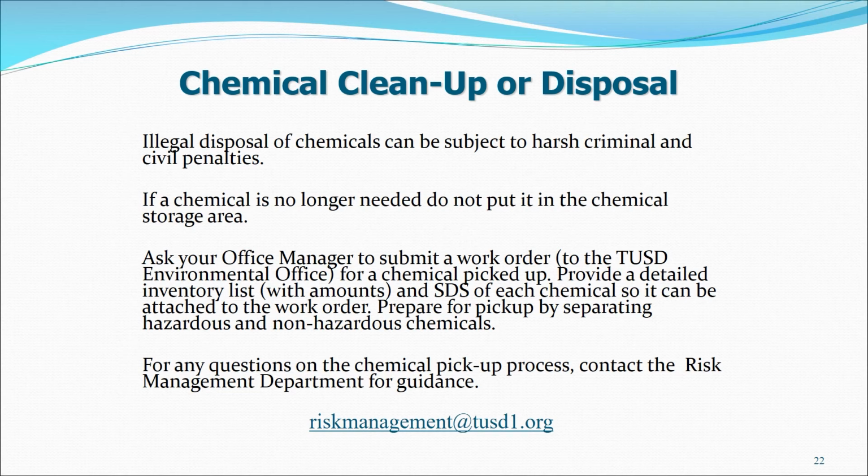Speak to your office manager or science department chair about your need to have unwanted chemicals picked up and disposed of. The office manager can submit a work order to the TUSD Environmental Office at Operations. The work order must contain an inventory list of the exact chemicals with the amounts and an SDS per chemical. Hazardous and non-hazardous chemicals must be separated for pickup. The Risk Management Department can give you more information on the pickup process if needed.